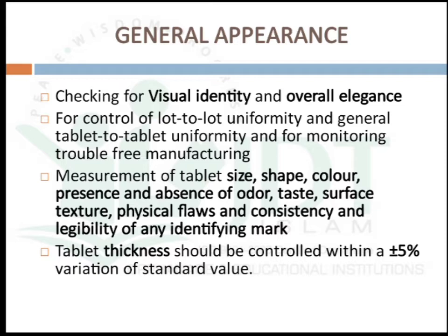In this, measurement of tablet size, shape, color, presence or absence of odor, taste, surface texture, physical flaws, consistency and legibility of any identity mark are checked. In case of thickness, the tablet should be controlled within plus or minus 5% variation of the standard value.